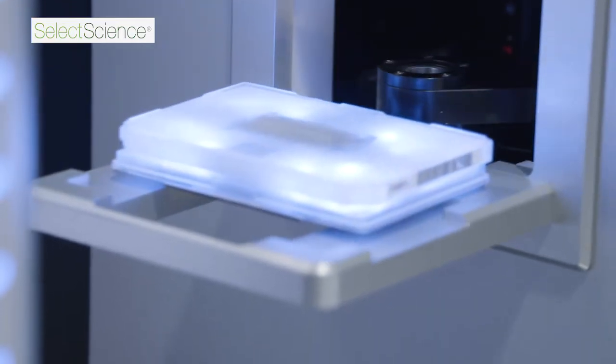Traditional antimicrobial sensitivity testing can take between 1 and 3 days, depending on how difficult the bacteria is to grow, isolate, and then test for sensitivity. However, we can, using the flow cytometer, do this much more rapidly. Within 1 hour, we can tell you whether or not the drug will be effective, so susceptible or non-susceptible, and within 3 hours, we can give you a full characterization of inhibitory concentrations.